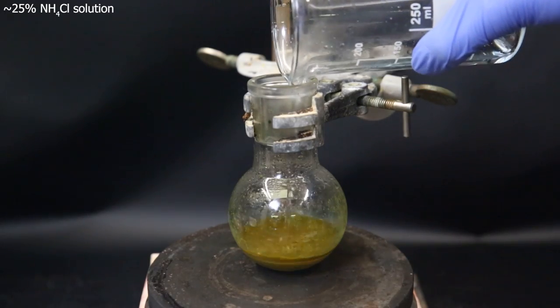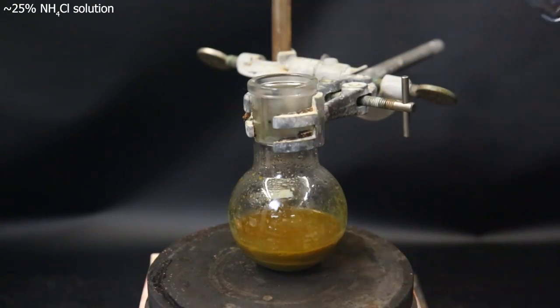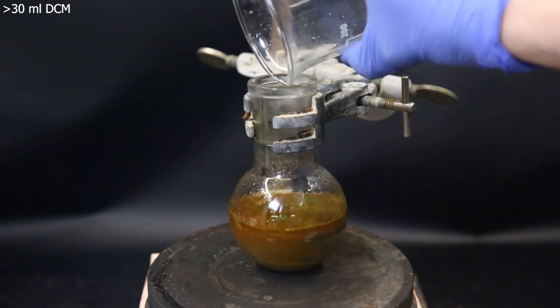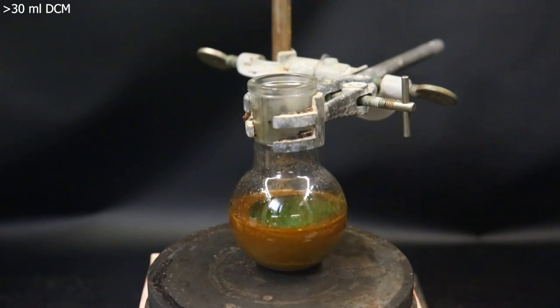Now to remove most of the catalyst, I dilute the reaction mixture with a 25% ammonium chloride solution. I then add about 30ml of DCM to extract the product.